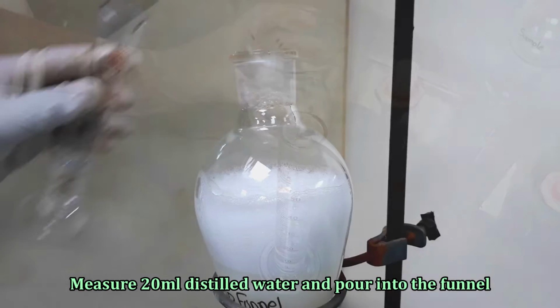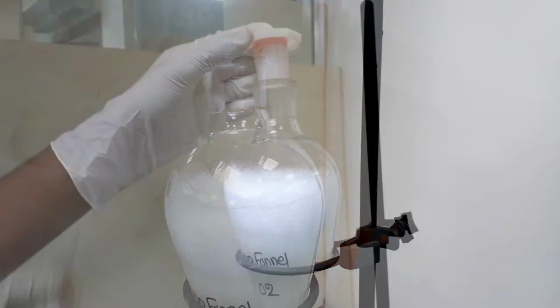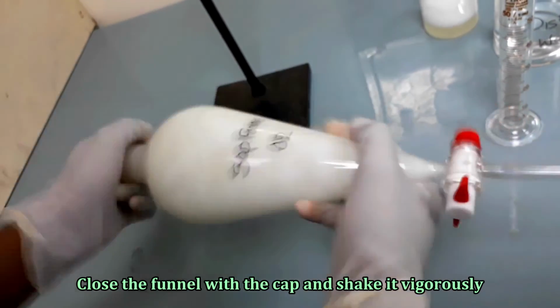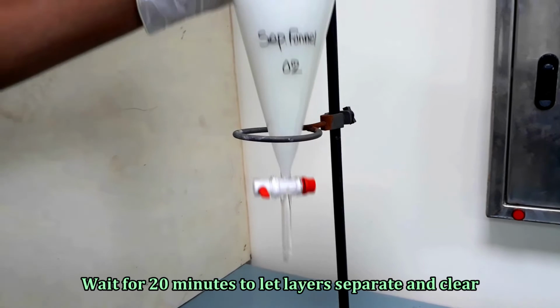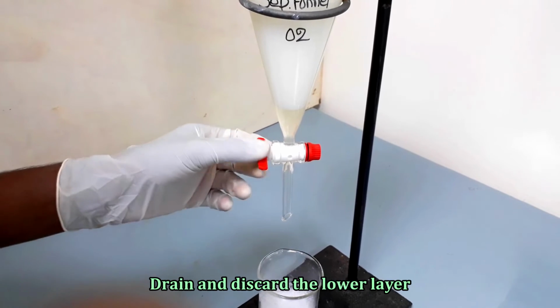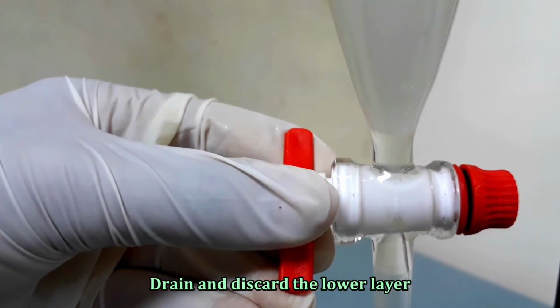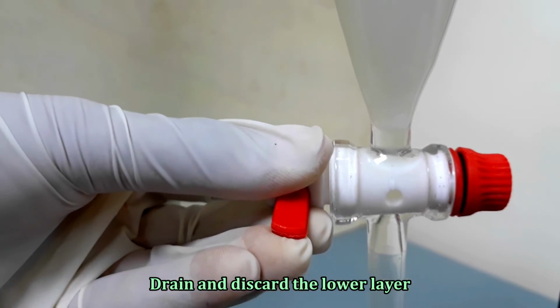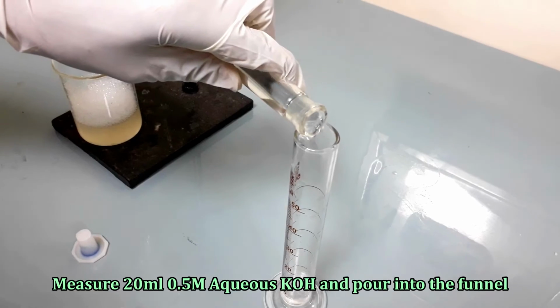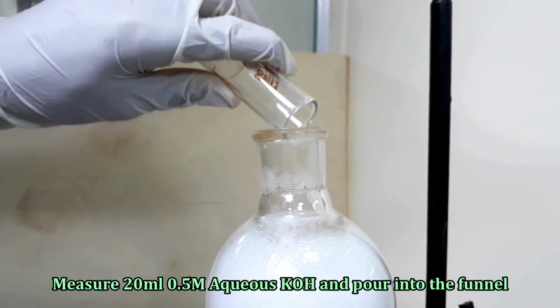Wash the extracts with distilled water in the same manner as done in washing 2. Again wash the extracts with 0.5 molar aqueous potassium hydroxide solution in the same way as done in washing 3.